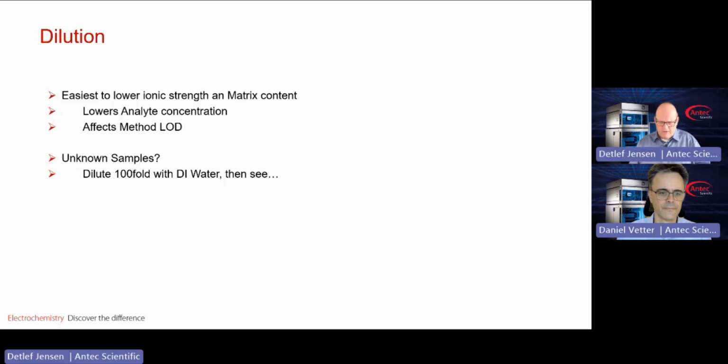So if you ever find yourself in a situation where one sample shows a significantly shorter retention time than the next sample, it is likely that in the sample showing the lower retention times, a higher concentration of inorganic salts or organic acids might be present, and you don't see them.